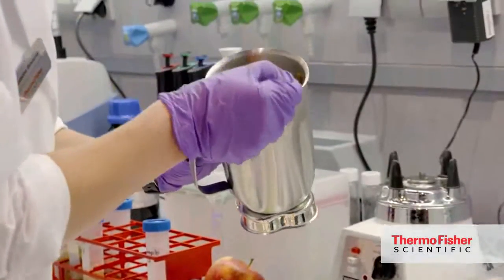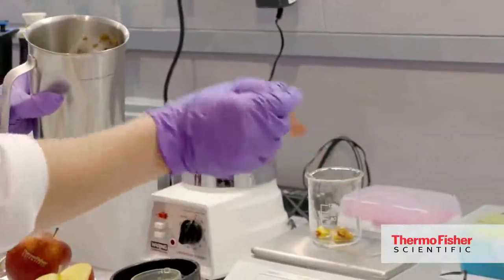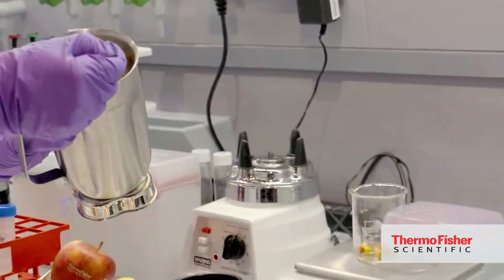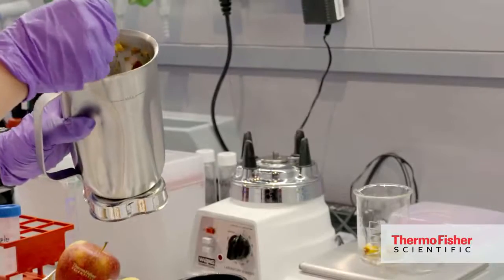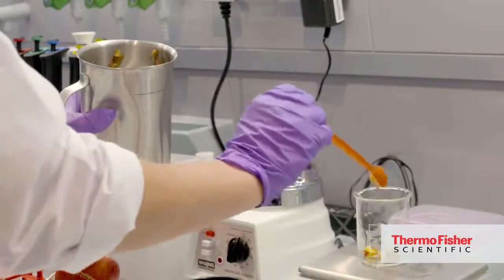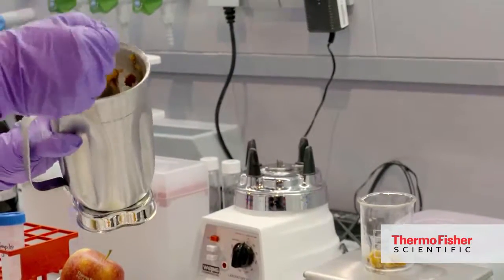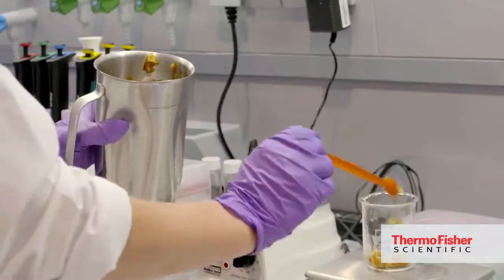So we have two options. Either we do the sample preparation with the classic QuEChERS method, but what we demonstrate this time is using the accelerated solvent extractor-based method. First of all, we need a given sample weight. This is what is ongoing.